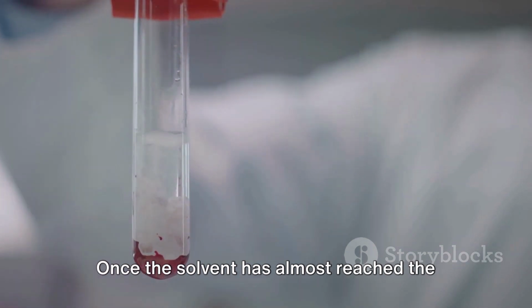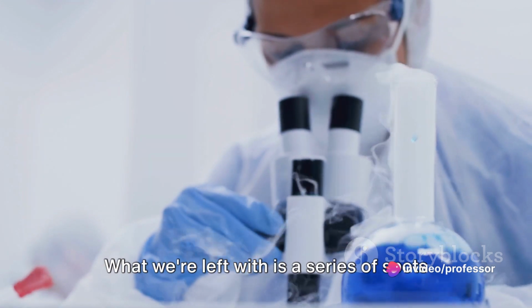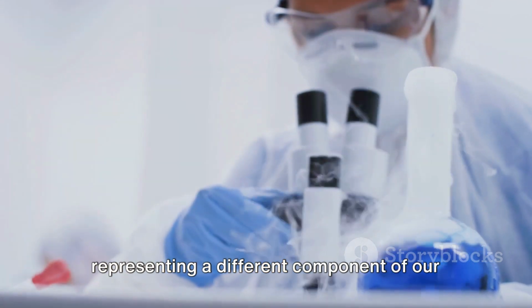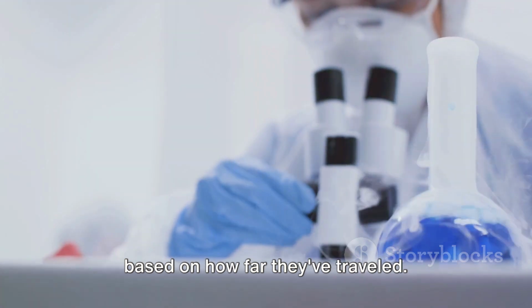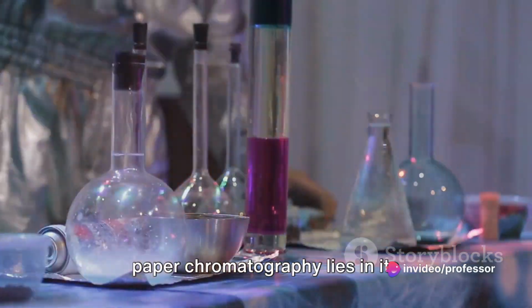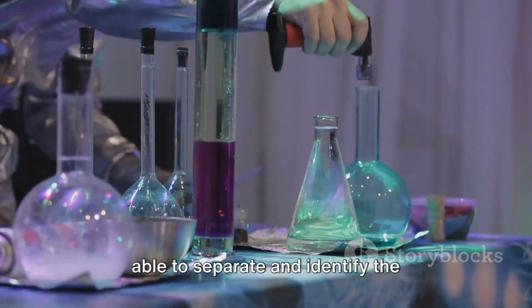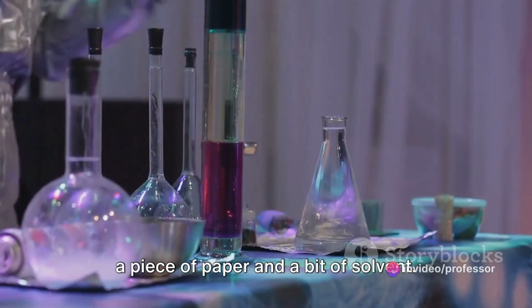Once the solvent has almost reached the top of the paper, we remove the strip and allow it to dry. What we're left with is a series of spots or bands along the paper strip, each representing a different component of our original mixture. We can then identify these substances based on how far they've traveled. And there you have it. The beauty of paper chromatography lies in its simplicity and effectiveness. Through a straightforward process, we're able to separate and identify the components of a complex mixture, all with a piece of paper and a bit of solvent.